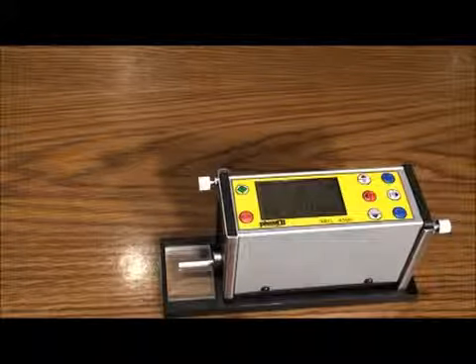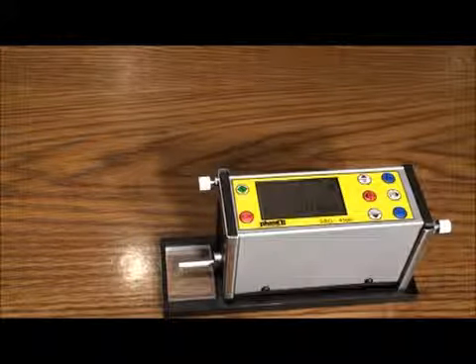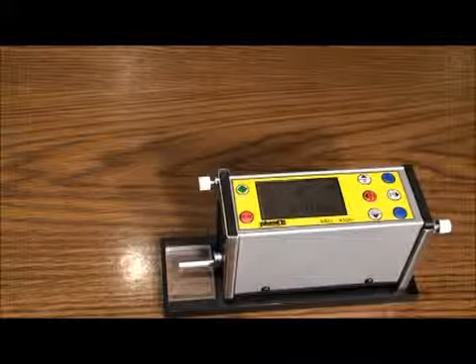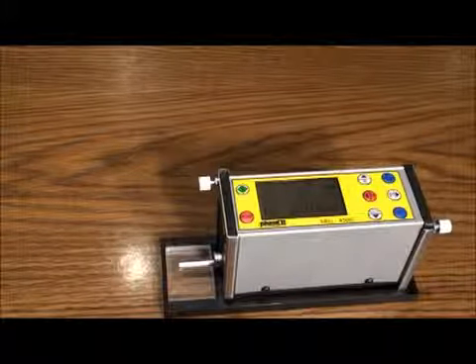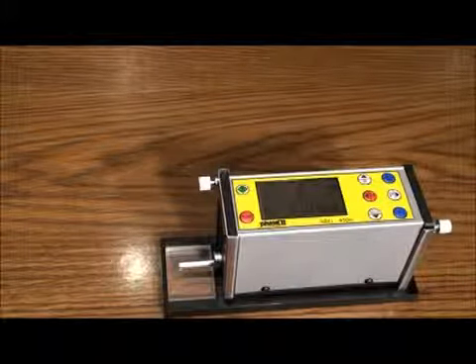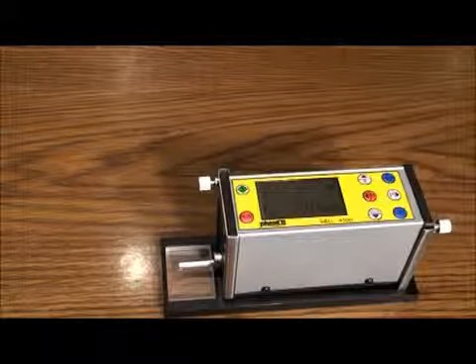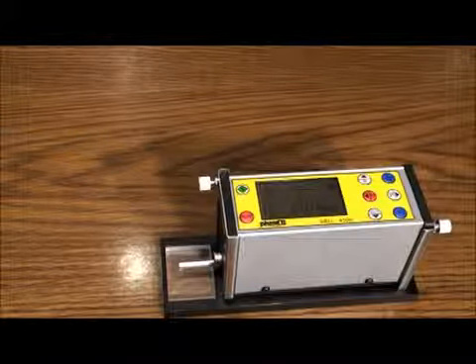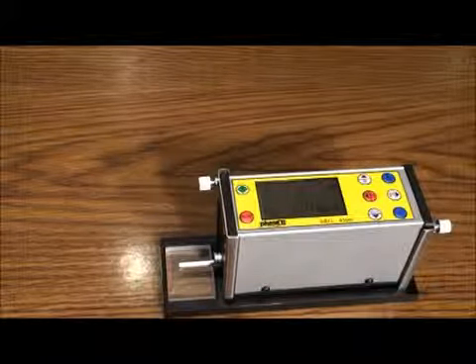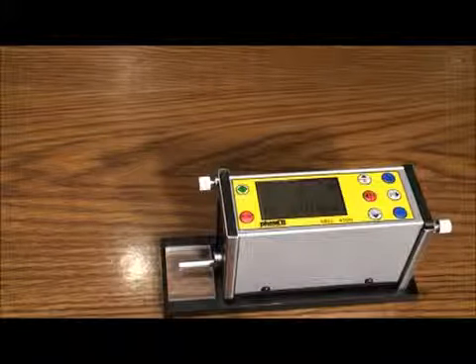The technology used incorporates a skid type instrument in which a diamond stylus is automatically traversed across the specimen and a piezoelectric pickup records all vertical movement. Peaks and valleys are recorded and converted into a known value of a given parameter. Parameters differ in how they look at peaks and valleys.